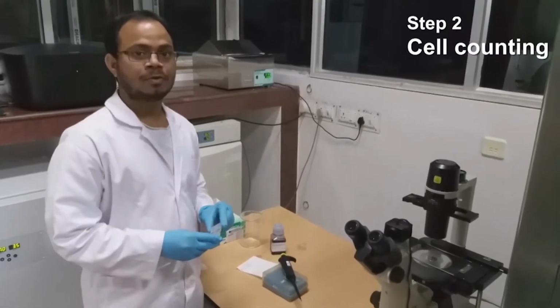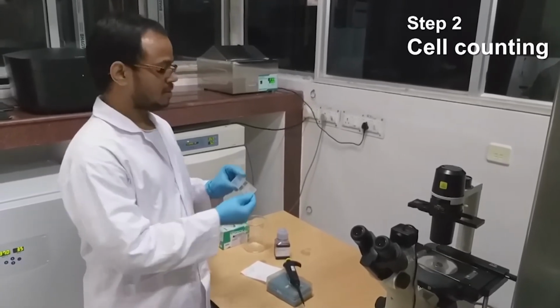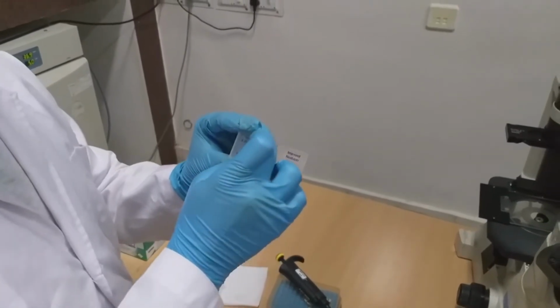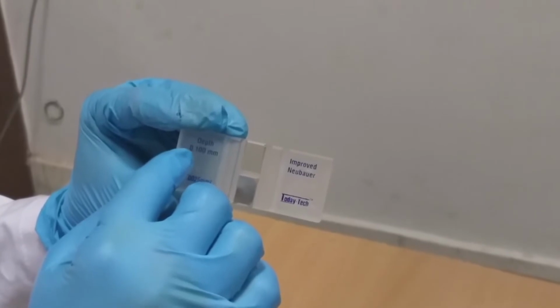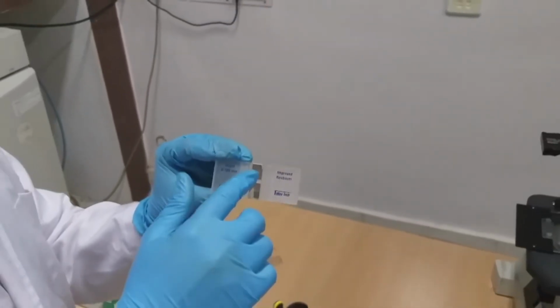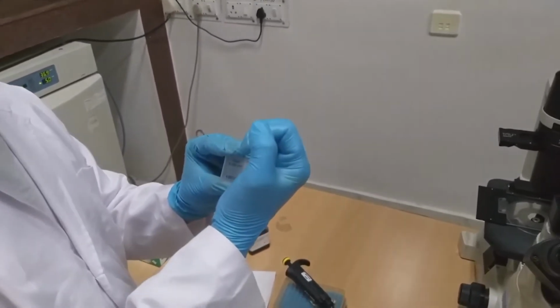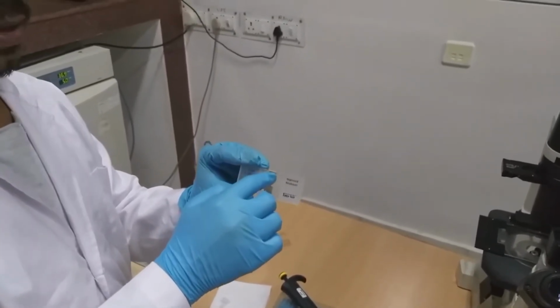Before counting, we have to see how a counting chamber or hemocytometer looks like. This is a typical hemocytometer, also called a Neubauer chamber, which contains these squares on the upper side and lower side, with each square having a depth of 0.1 mm and an area of 0.0025 millimeter square. Now I am going to put a cover slip on this chamber. Then I will slowly add the cell suspension. Through capillary action, it will spread all over the squares.